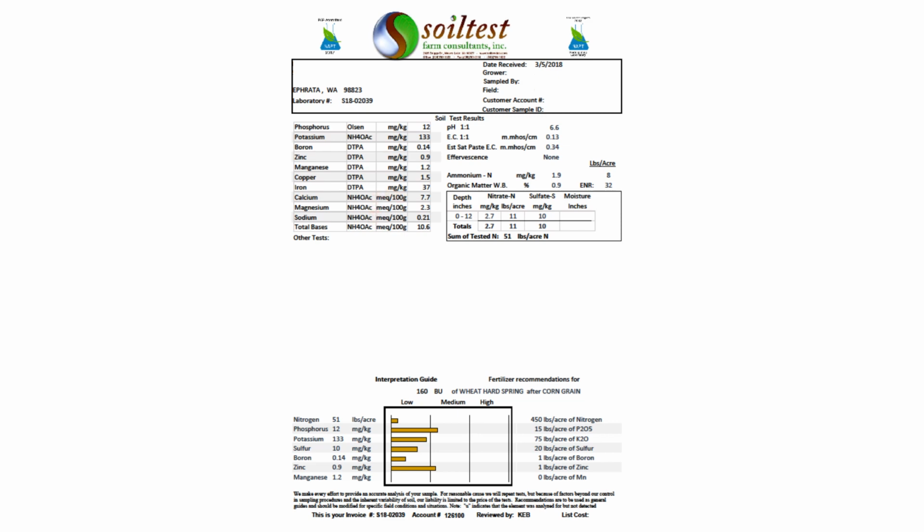If one wanted to determine the percentage of calcium that occupies the cation exchange sites, with the units listed as milliequivalents per 100 grams, they would simply take the result of the calcium divided by the CEC, and they would be able to determine the percentage of calcium that occupies the cation exchange sites. In this case, cation exchange capacity is not measured, but I have an example on a subsequent report.